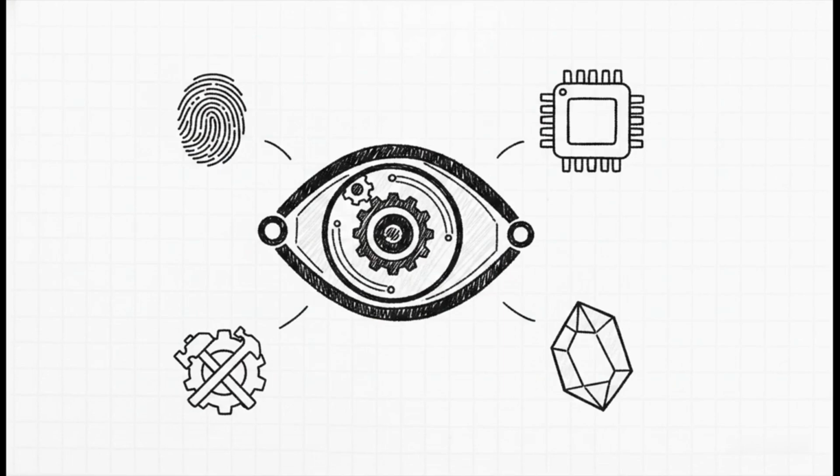It is an absolute necessity in material science for developing new alloys. It's the backbone of quality control in nanotechnology and semiconductor manufacturing. Geologists use it to understand mineral formation. Metallurgists use it to diagnose metal fatigue, and forensic scientists absolutely rely on it to analyze gunshot residue or microscopic paint chips at crime scenes. The applications are, for sure, virtually limitless.